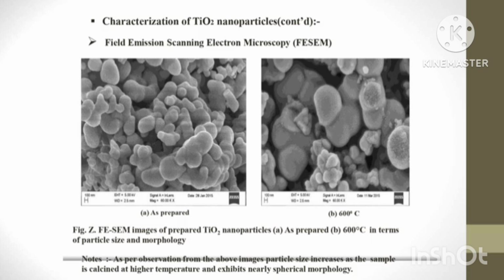After all the analysis, they give you the images, and by using those images you can find out these properties. So all the images that you can see in my previous slide are FESEM images.